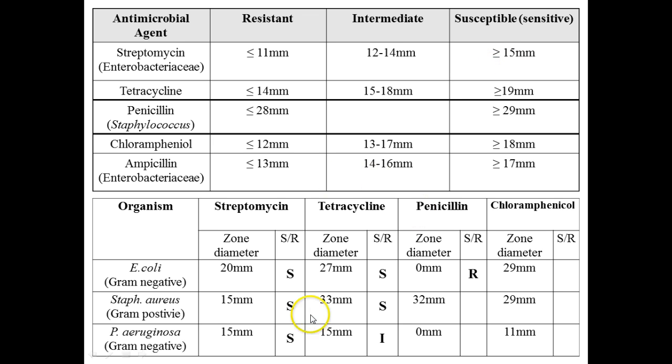And this one actually fell into intermediate mode. I'm going to prep this other gram-negative for us, too, to be able to look at next week. And you'll see that it tends to be resistant to a lot of antibiotics. And we'll talk about that when we look at those plates.